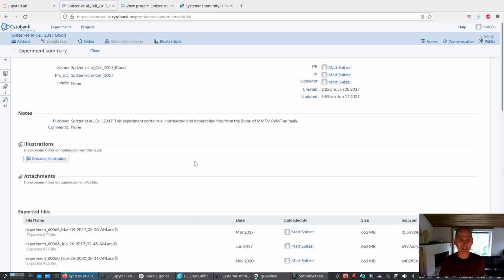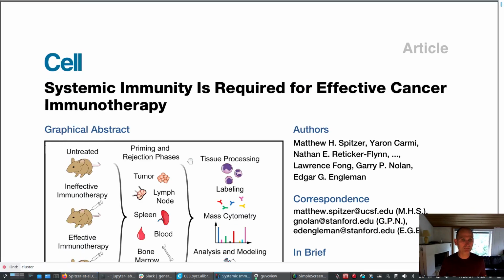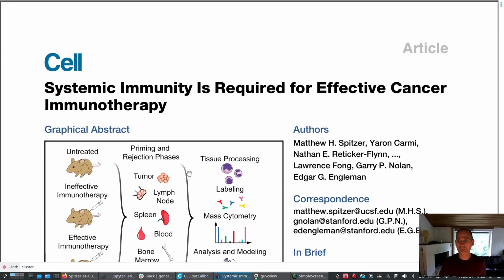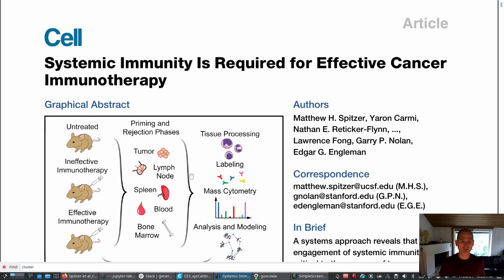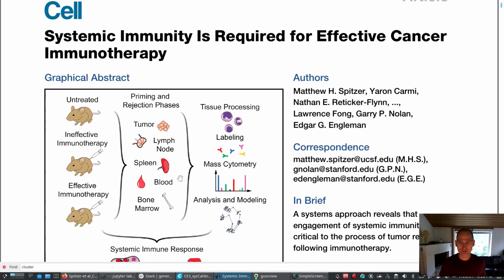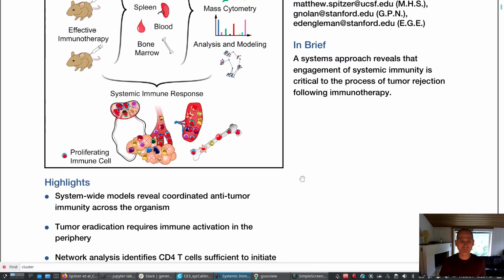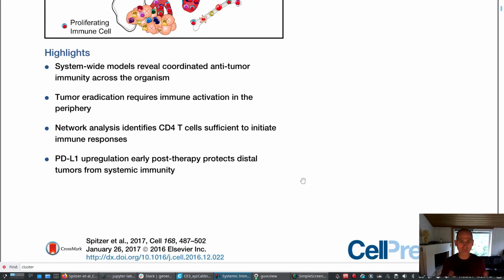It has been published in Cell, so I can show you the paper, I guess. It's here, and it's a typical cytof biology paper where they do clustering. They have a method of their own that they call scaffolds, I think. And then they come with some conclusions that these populations are affected by therapy or by strata of patients or mice or whatever.